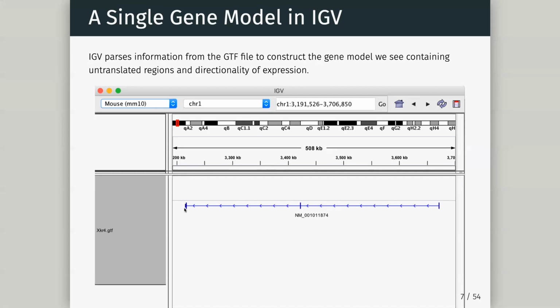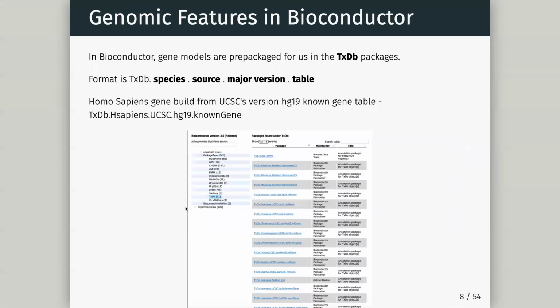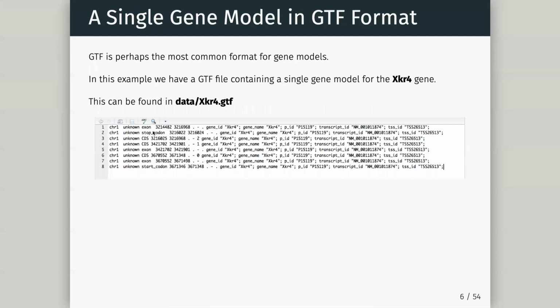But if you look here, at the end of this little bit, maybe it's better on your screen, you can see you have a slightly smaller block here for the exon, and that's the untranslated region. So probably the additional bit, which way was it going? It's going that way. So the stop codon, there's probably a little overhang here. Yeah. But there's a region which is exon, but not coding.